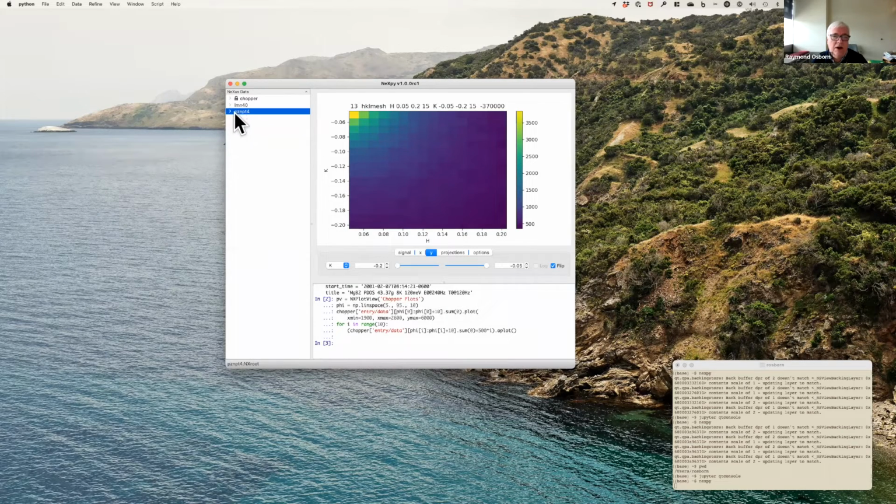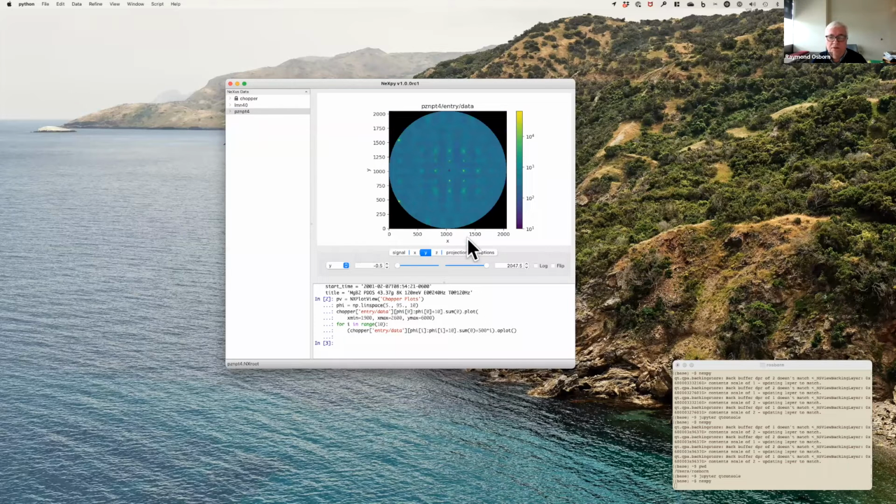And now this is a three-dimensional data set. So we have now a Z tab if you're in Europe, and I can scroll through that. In fact, I can run a movie through that, for instance, and run through all the different TIFF images, but they're now stored as a single three-dimensional HDF5 array. Okay, I need to move on.